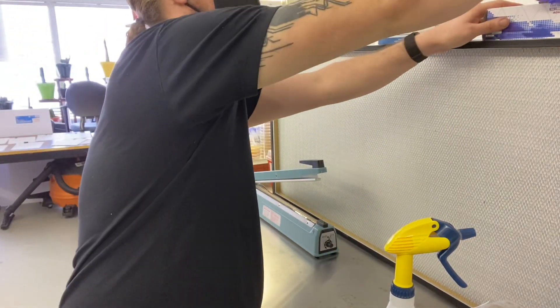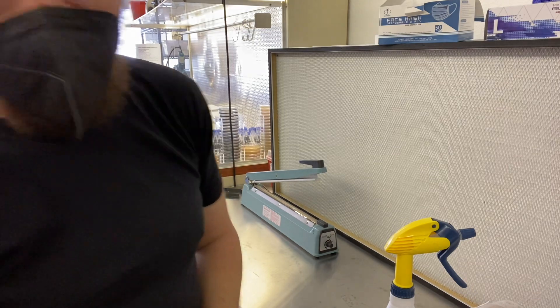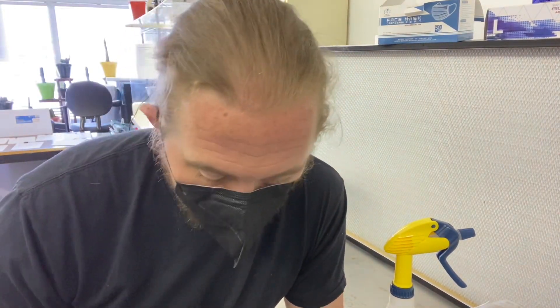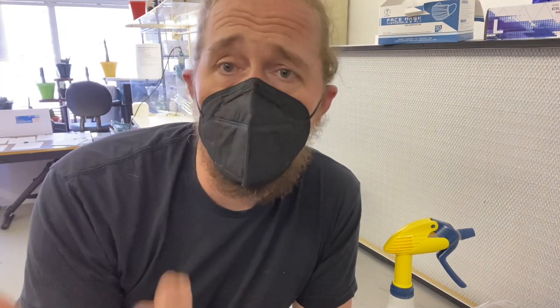Gloves. Now, you're probably saying, Jesse, single-use plastic — and I hear you on that. Single-use plastic sucks. And you're saying, well, maybe if I sterilize my hands enough I can work in front of the flow hood safely. Let me show you my right hand. I'm right-hand dominant, and I use this for everything — making soil, making grains, everything, day in and day out. Look at my nails and cuticles and my skin. There's stuff in here that's not going to come out for another month probably — it's like dirt, it's sand, it's god-awful stuff. It doesn't matter how much iso and soap I use on this; there's going to be cracks and crevices and stuff flying around. So that's why you're going to put on some gloves.